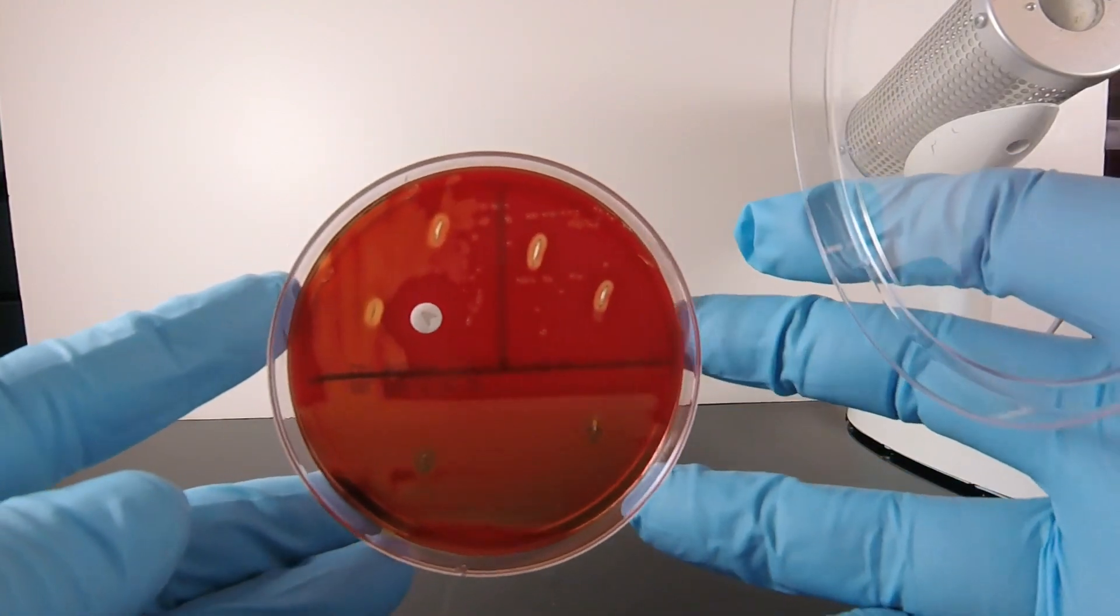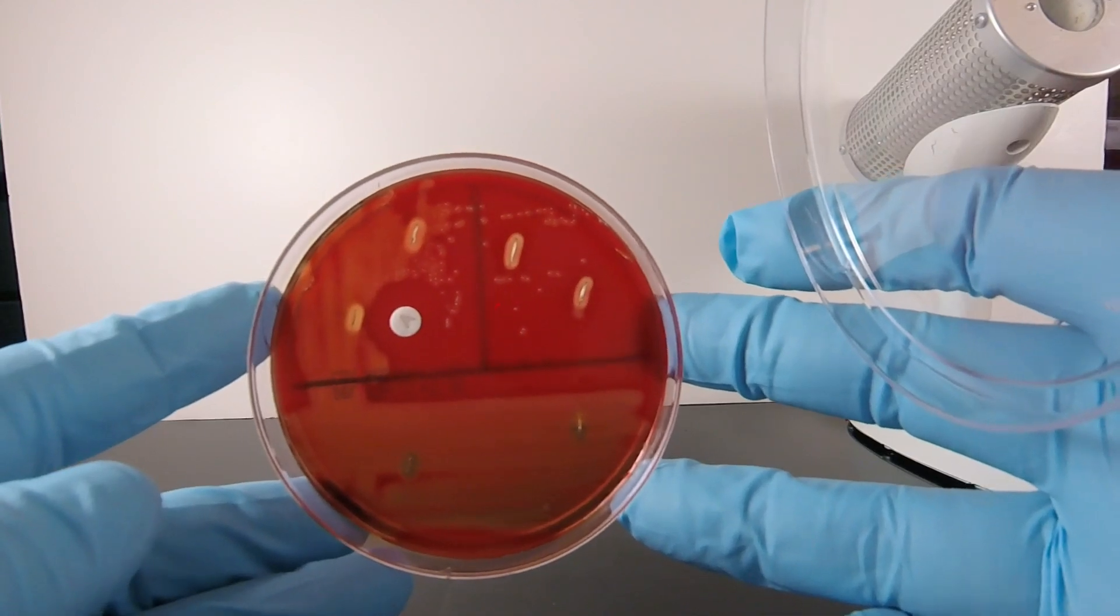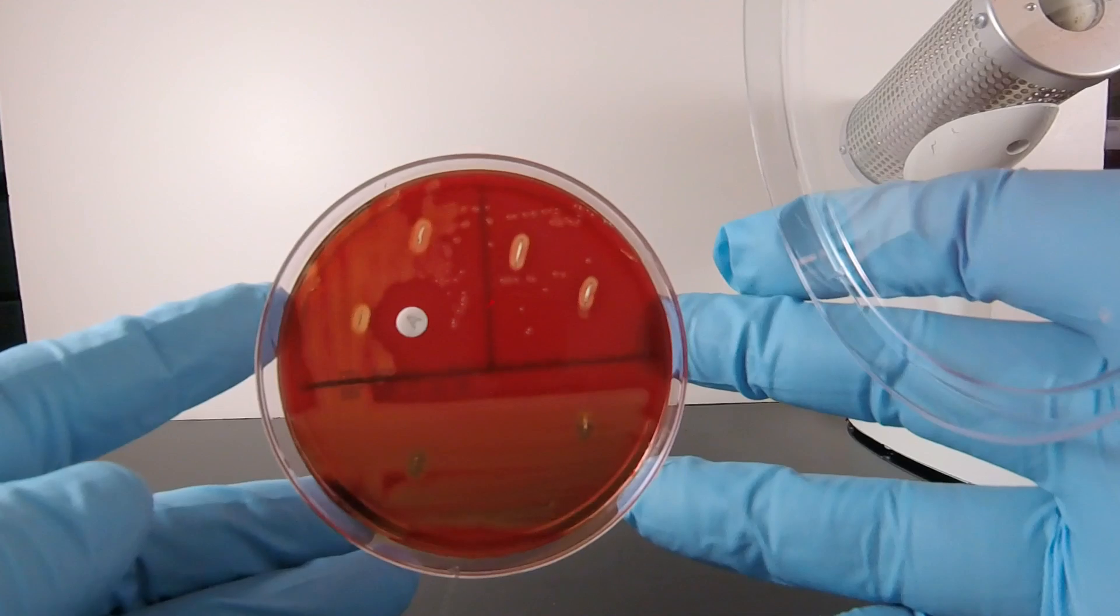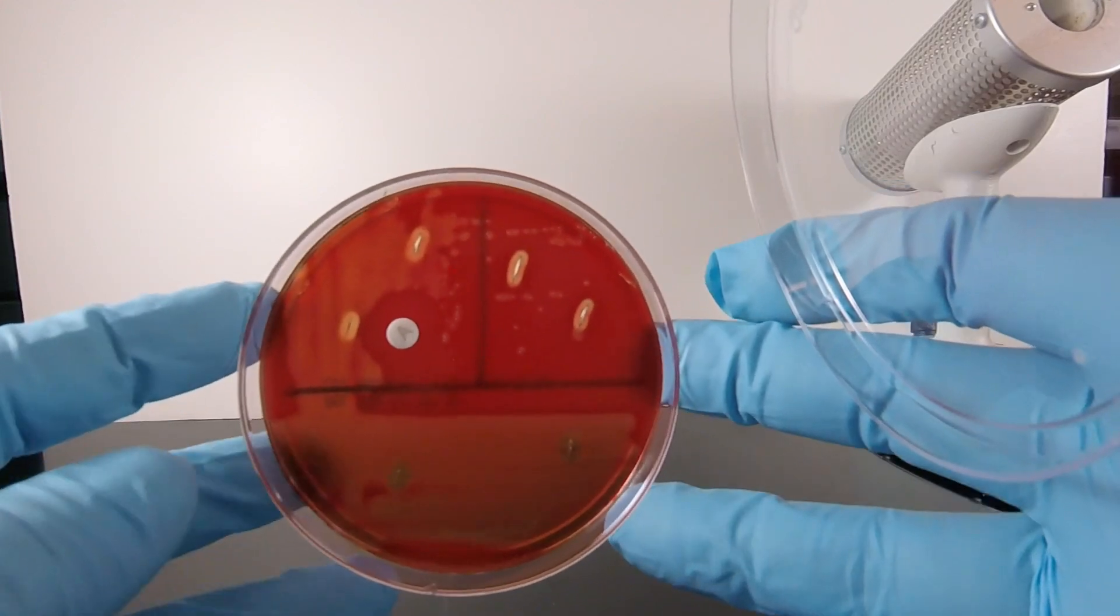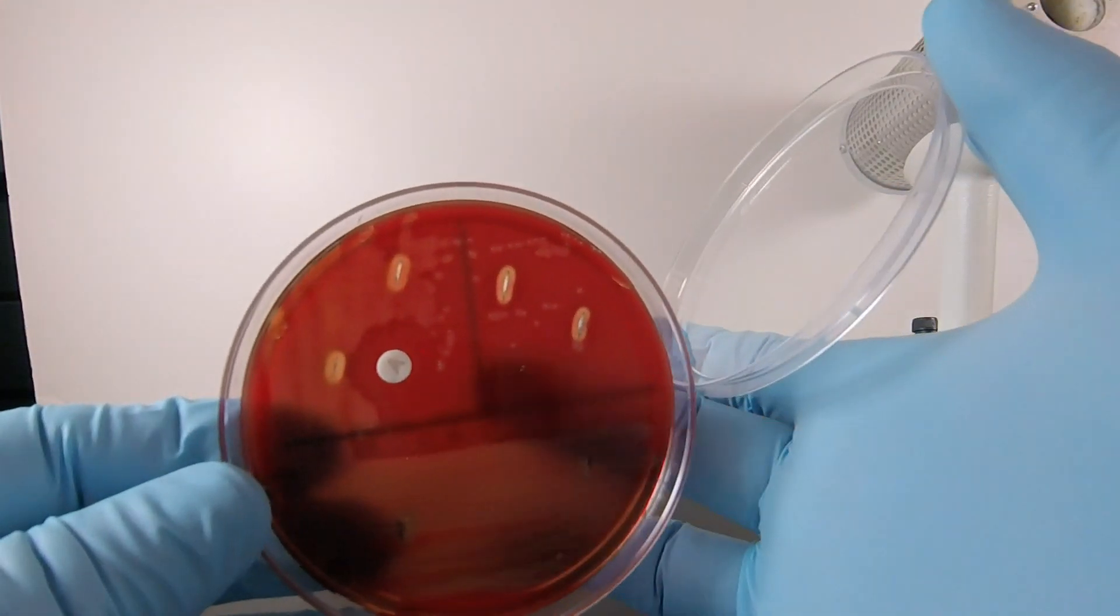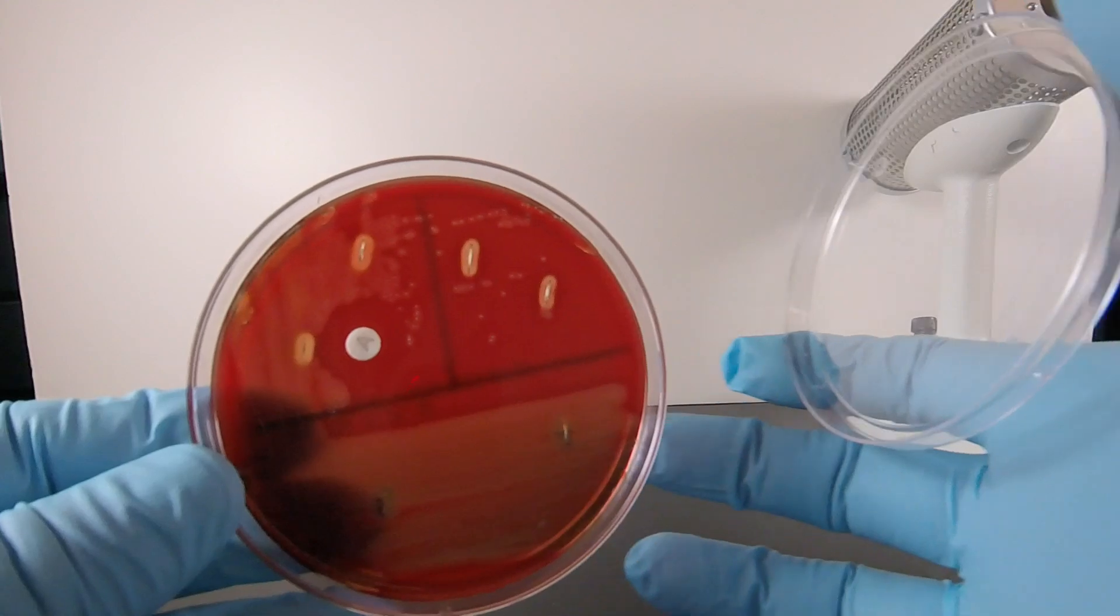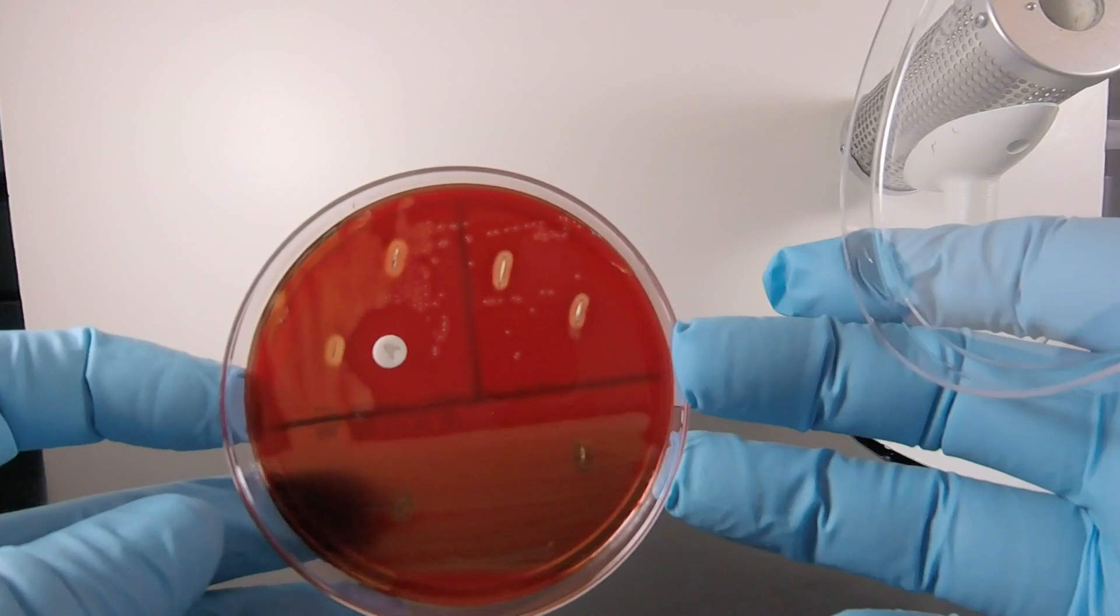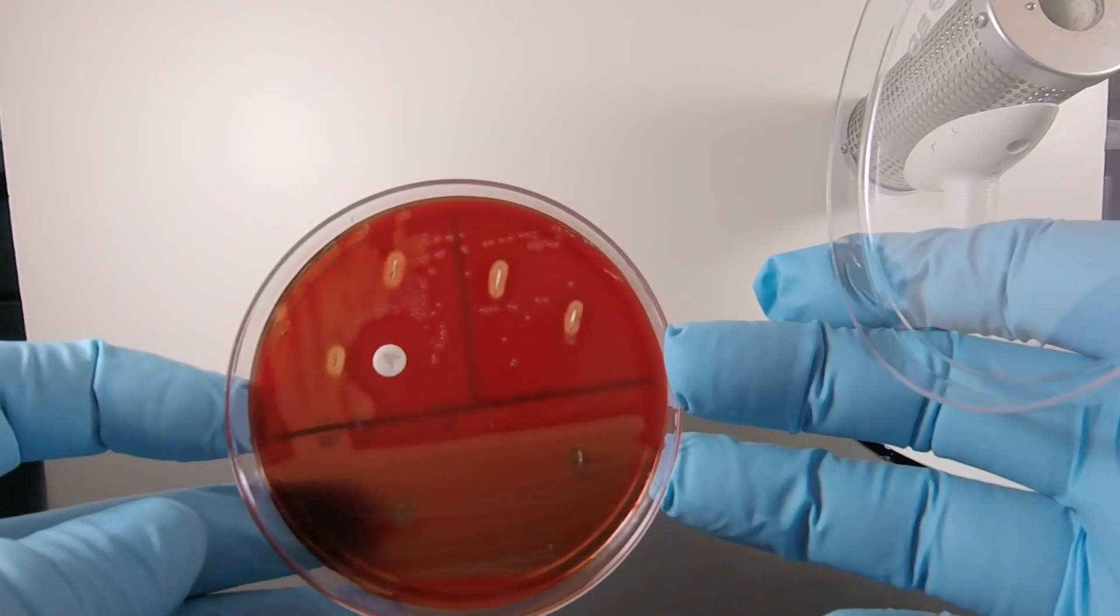You notice around the individual colonies there's kind of a partial clearing where the hemolysins are working their way through the agar. You see that around the individual colonies, around the solid growth, and again where the agar was stabbed, where all the hemolysins are functioning, you see complete hemolysis overnight.